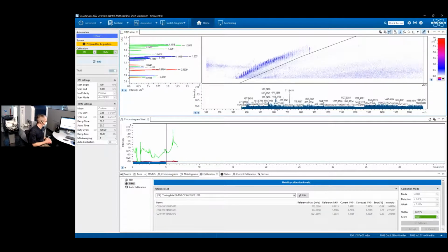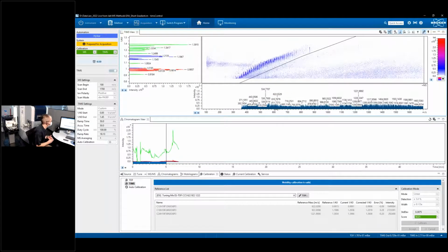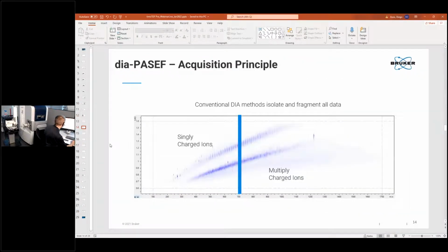Yep. Brilliant. There's a question about higher charge states than 2 and 3. I take it there's no restriction in looking for them? Not at all, right? So in fact, if we just come back quickly to that slide where we showed that heat map, where we set the windows. So these are all the multiply charged ions, right? So this darker patch here will be most of the doubly and triply charged ions, which of course we see most in tryptic digests. You'll see some other ions here, so those higher charge states will end up just having lower mobilities here, right? Lower what we call 1/K0s. So they will fall a bit further down here, but there's still something that the windows will happily pick up. Or of course you can adjust the windows if you want to focus on those ions in particular.